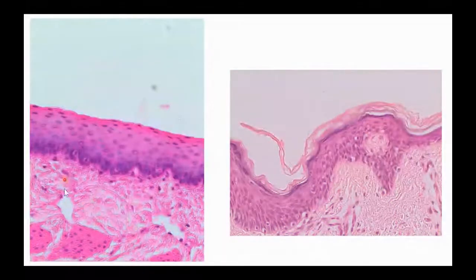So connective tissue is always going to look messier. Remember that connective tissue has a bunch of proteins in it. So we got a bunch of proteins going on down here. We got all of our cells that are epithelial tissue, and then we got open space. So you're going to look next to that open space to figure out what shape our cells are. These cells are really flat and squished. What would be the name I use for these cells? If they're really flat and squished, what was my shape word for these guys?